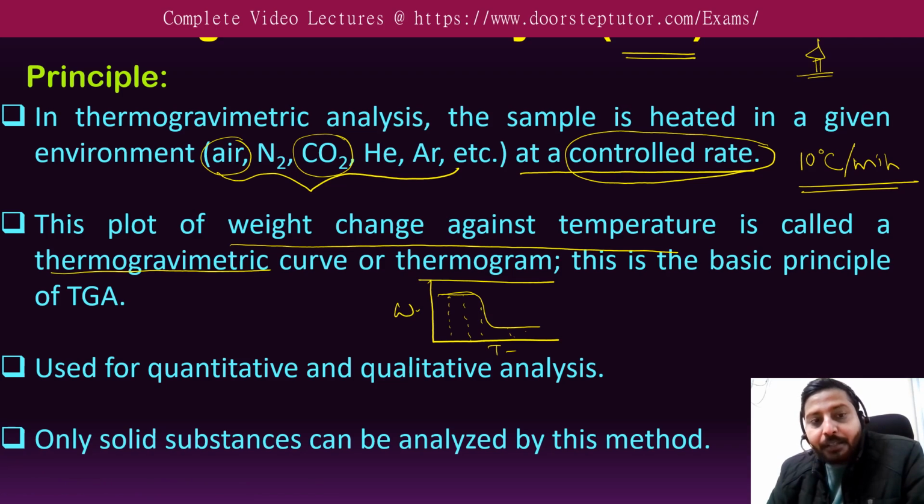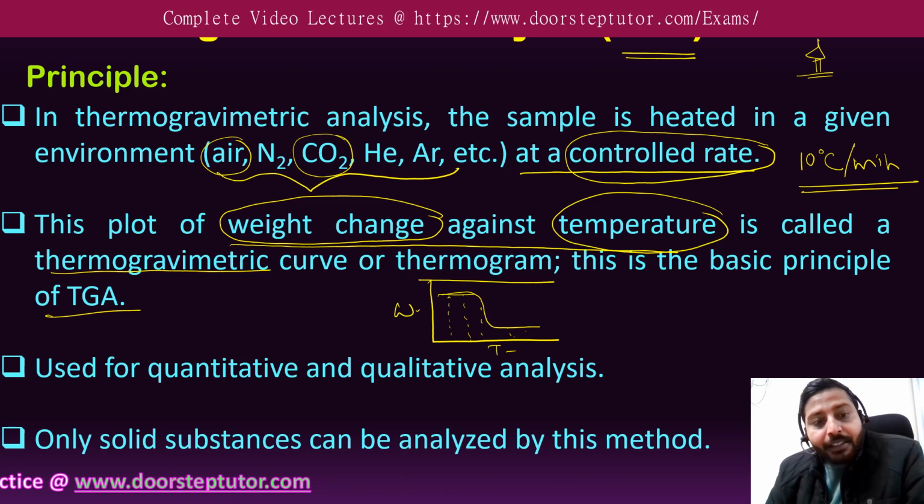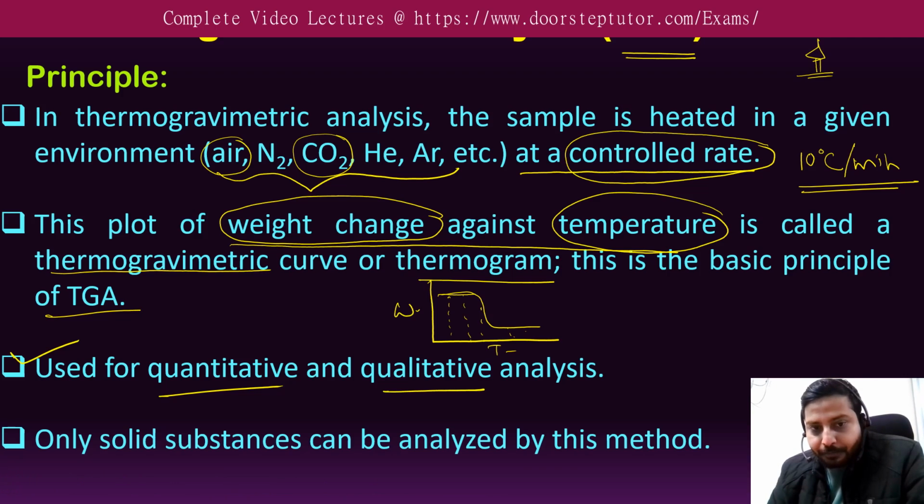This is the basic principle of TGA: the weight change is plotted against the temperature that we increase at a controlled rate. This is a quantitative and qualitative analysis.